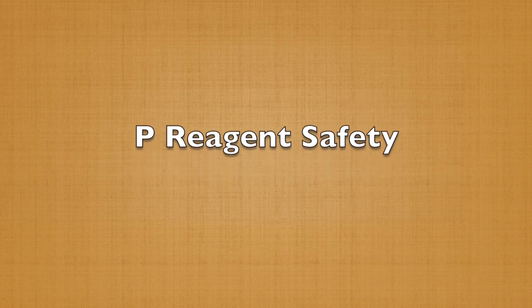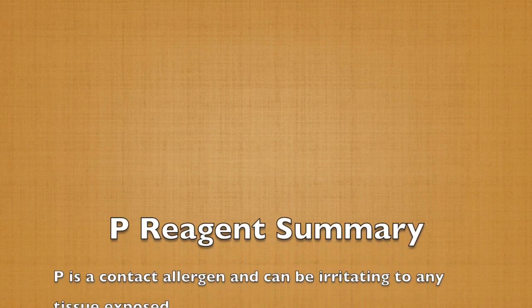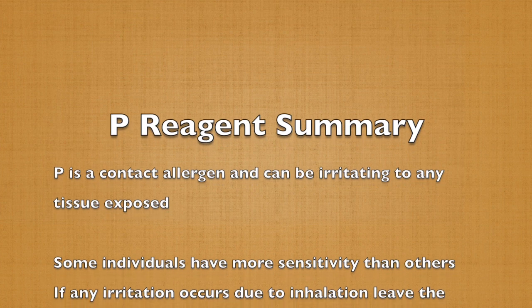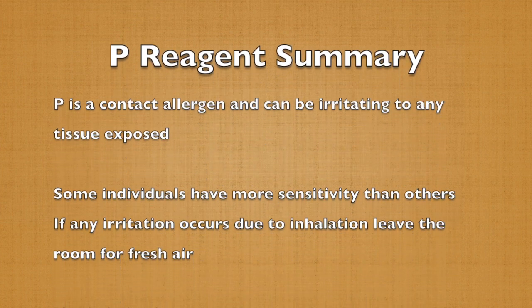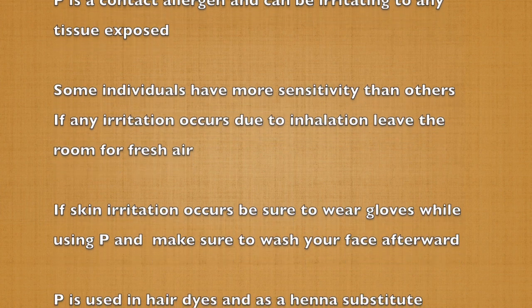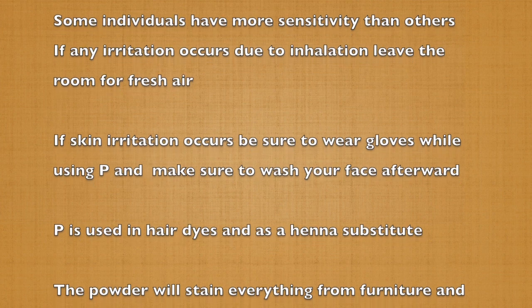P reagent also requires caution, as it is a contact allergen and can cause varying degrees of irritation in any tissue exposed. Some individuals are highly sensitive to P and may experience dermatitis, throat irritation, and bronchial asthma. The most common use for paraphenylenediamine is as the active ingredient in dark-colored hair dyes and as a henna substitute. If you know you're allergic to hair dyes or henna, it might be best to limit your exposure to P as much as possible.